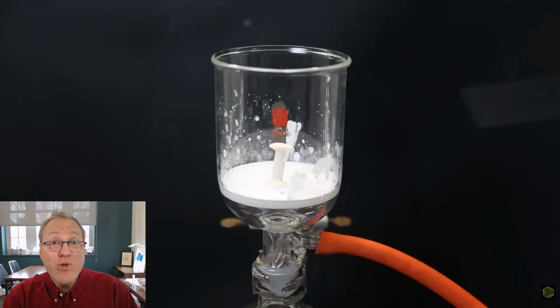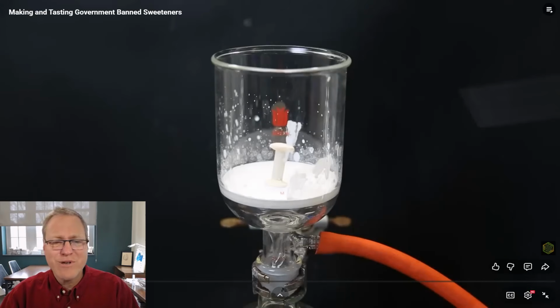I'm very much a Buchner funnel kind of guy, so I like these ceramic funnels. Now, if this were a ceramic funnel, you couldn't see through the glass so nicely. I'd have to take the camera and show what's in the top because that ceramic is opaque. But I'm not really a glass frit guy in lab. I'm very much a Buchner funnel with the filter paper in the bottom filter plate.